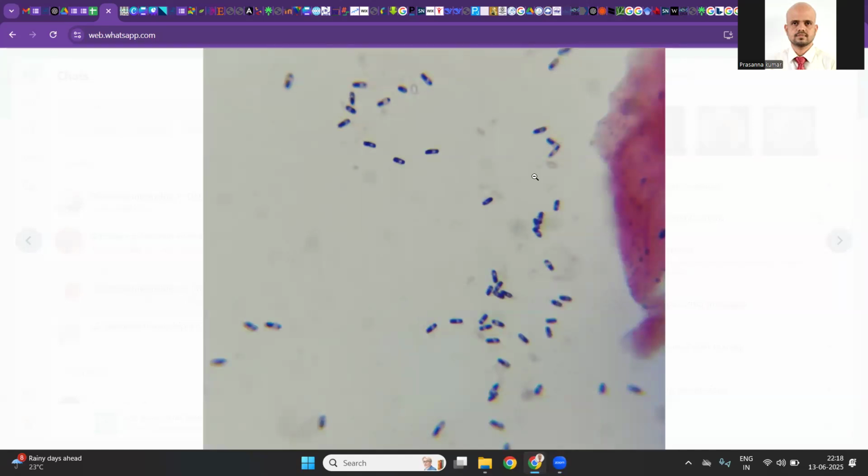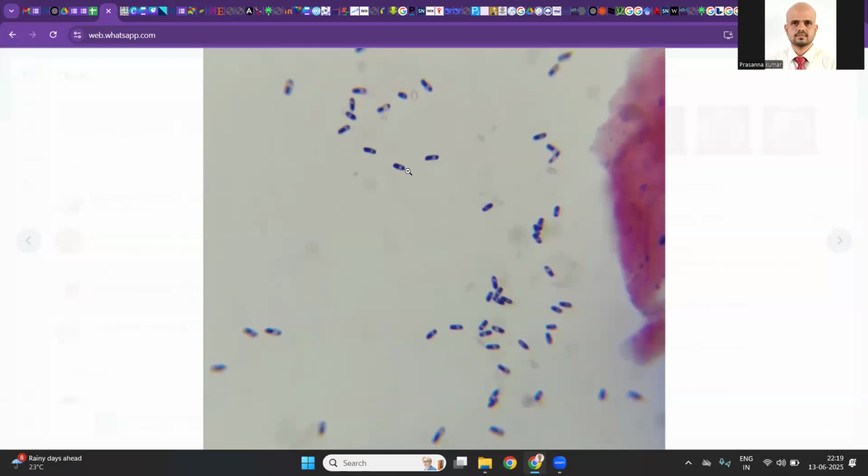very impressive. The ultimate objective of any staining in microbiology is to have isolated cells, single bacterial cells, and the ability to see single cells very clearly. I guess in this picture it is very much achieved. So we did a gram staining, and you can also see an endospore inside this. Most possibly this is Bacillus. You can very clearly see an endospore inside this.